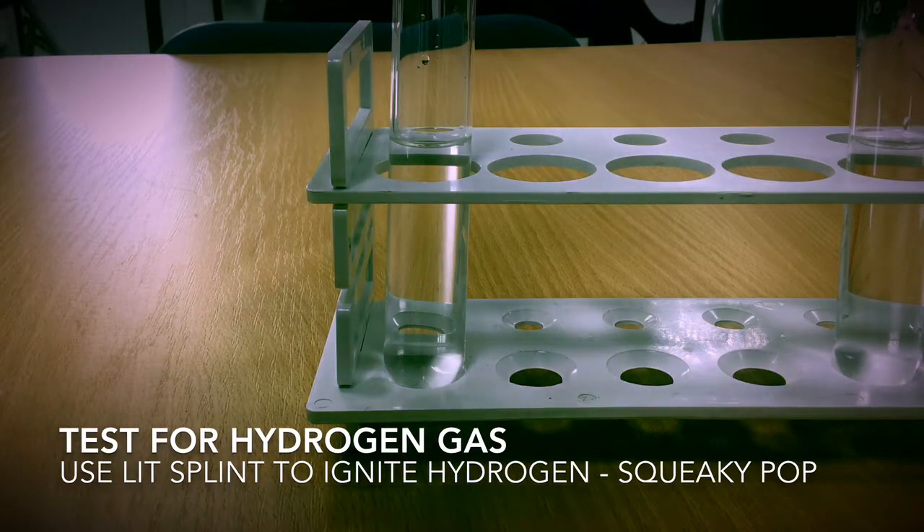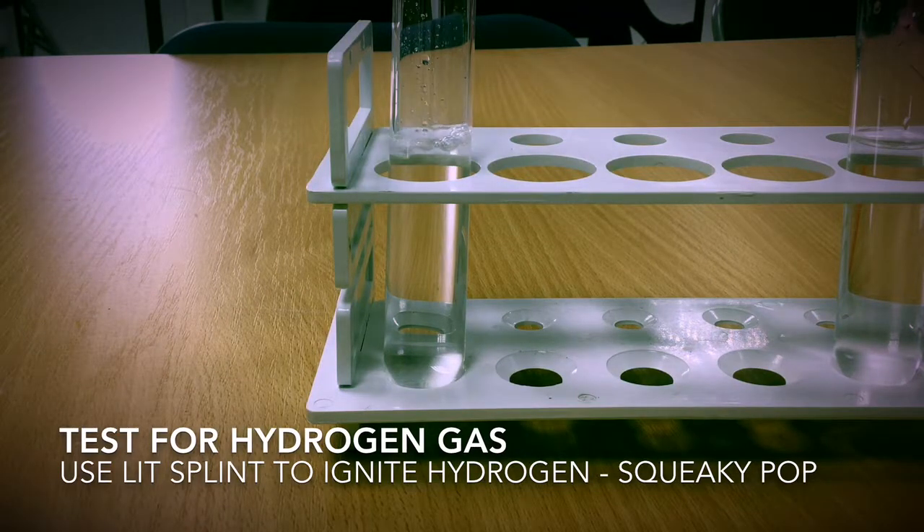I'm going to add the magnesium metal into the hydrochloric acid. You can see it bubbling away there. It is making the salt and it is releasing hydrogen gas.